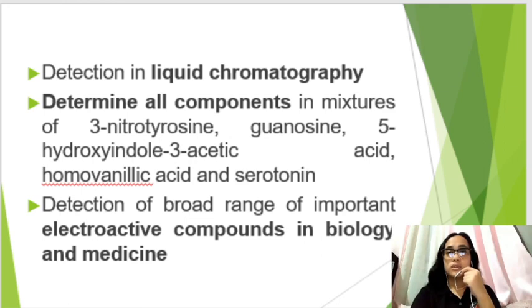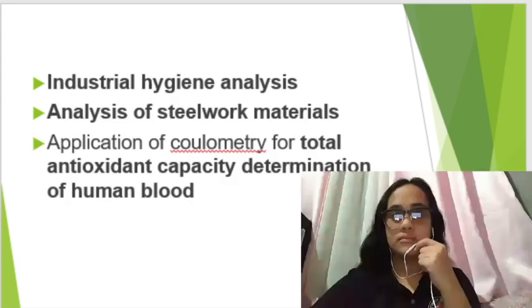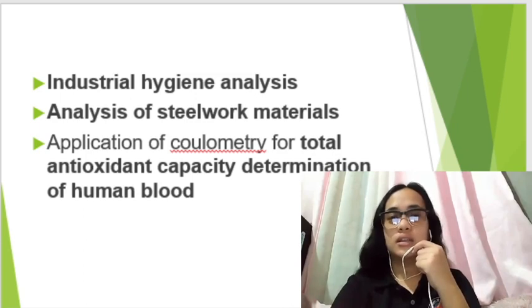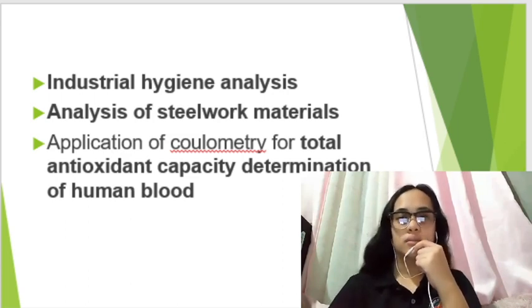Detection of broad range of important electroactive compounds in biology and medicine can also be used in coulometry. Also, it is used in industrial hygiene analysis, analysis of steelwork materials, application of coulometry for total antioxidant capacity, determination of human blood.